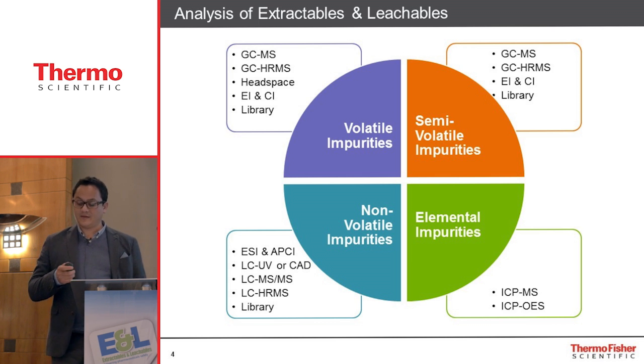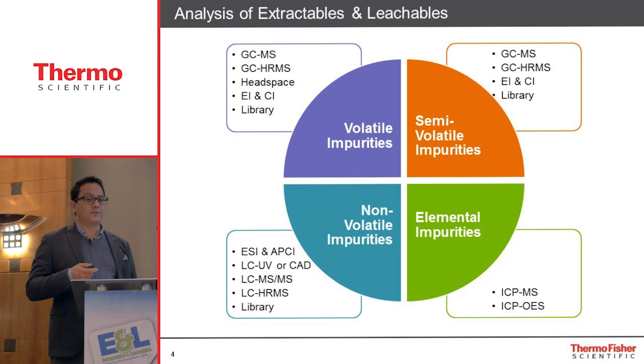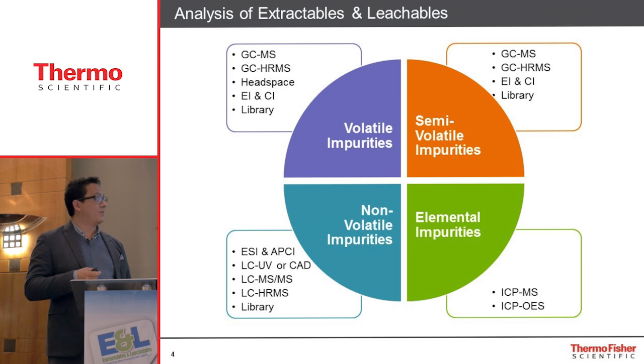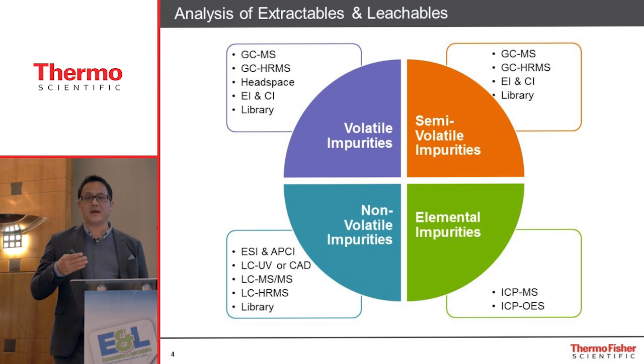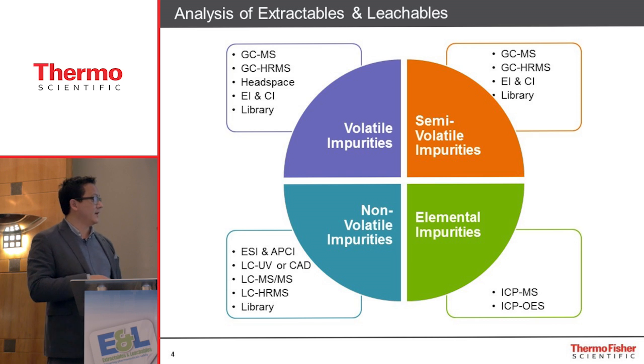And I think it's fairly safe to say that conventionally, mass spectrometry has really led the way in identifying unknowns. And as instrument vendors, we recognize that many people within the industry have reached out to us in the past, requiring additional capabilities. So there has been a general movement from mass spectrometry to high resolution mass spectrometry, both for LC and GC amenable compounds, often complemented with orthogonal detection such as UV, or more frequently today we see charged aerosol detection as a universal detector for unknowns.